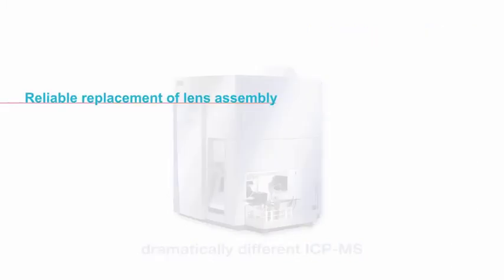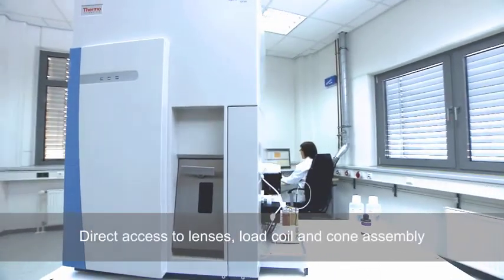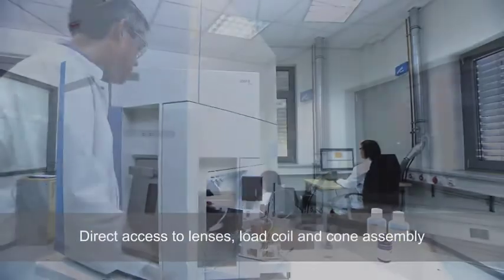Reliable replacement of lens assembly on the ThermoScientific ICAP-Q ICP-MS. The innovative ICP-MS design provides direct access to lenses, load coil and cone assembly.